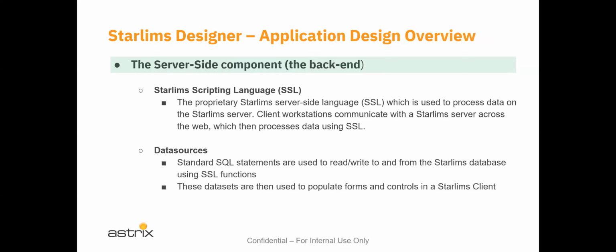Client workstations communicate with the STARLIMS server across the web or whatever connectivity is set up. With these latter versions of STARLIMS, we have the V12 environments mostly operating on the cloud now. So your database administrator, your remote system administrator from the STARLIMS environments, and the sales representatives have set that all up. You'll be communicating through the servers, and all of the data occurs between the clients and those servers across the cloud.